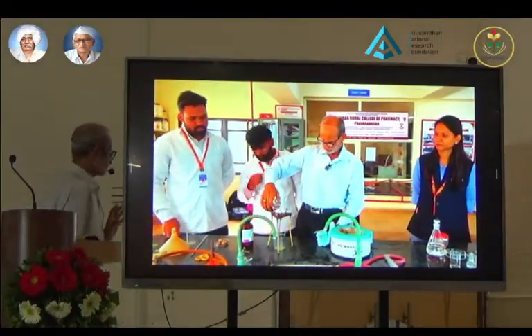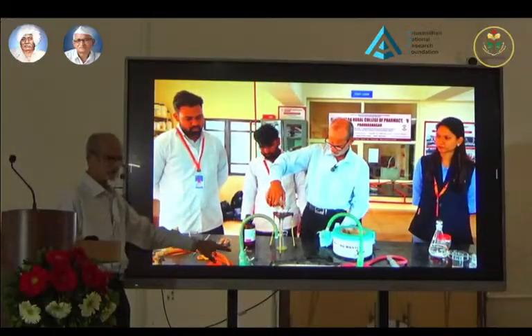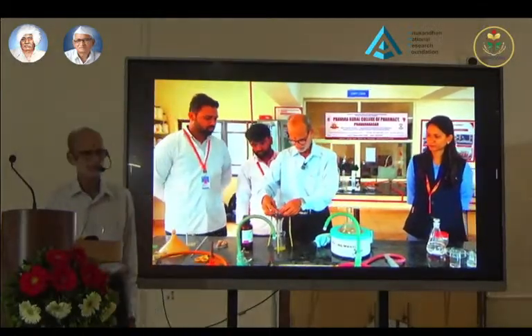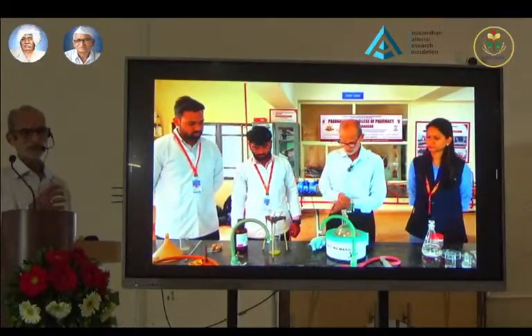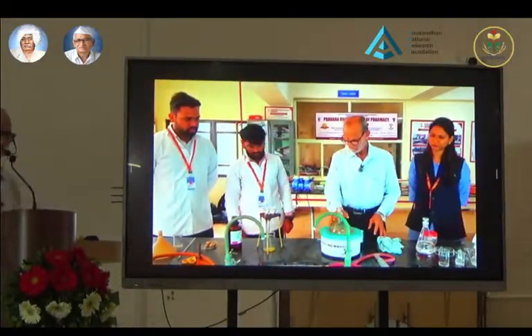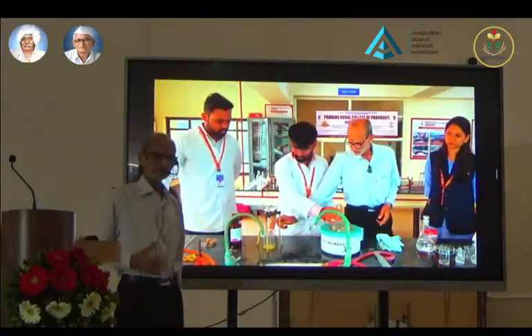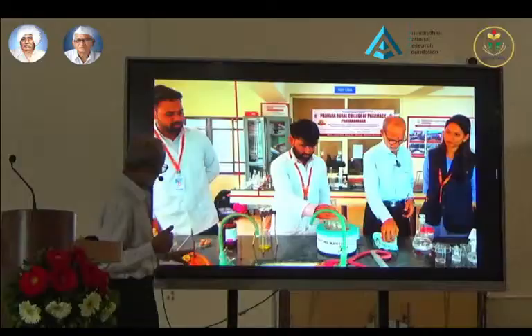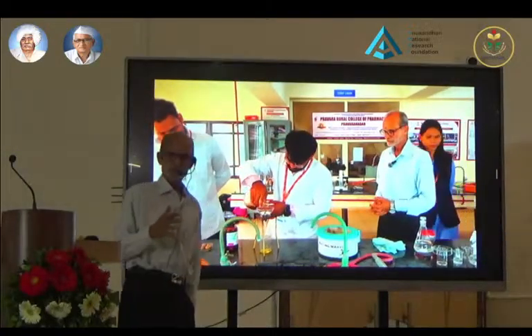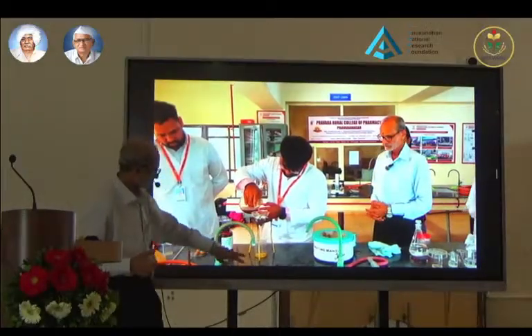What we did in this case: nutmeg is converted into a powder first, then it is extracted with chloroform, in which it is highly soluble. But nutmeg also contains volatile constituents, myristicin, elemicin and safrole, which also get extracted with the chloroform. And nutmeg butter, which primarily comprises trimyristin, also gets extracted. Both of them are refluxed, and now it is being filtered.